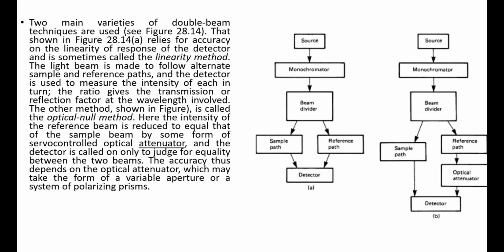There are provisions that you can directly ask for the concentration of the analyte, right? So the instrument will provide the concentration of the analyte directly. So you have to choose the mode, but whatever light is absorbed and transmitted will be taken cognizance of, it will be analyzed in the detector, and you will get the output, right?